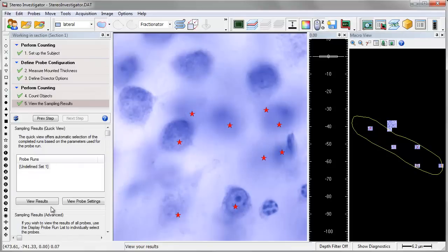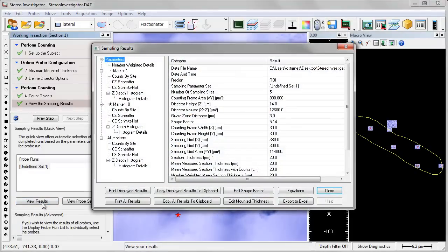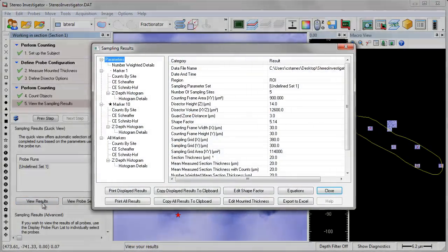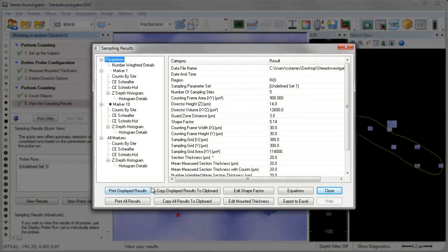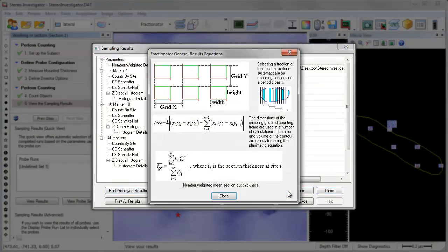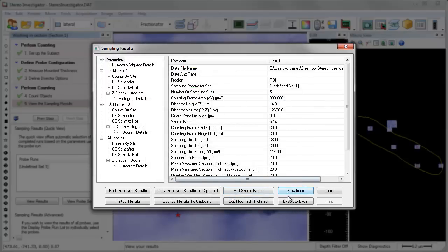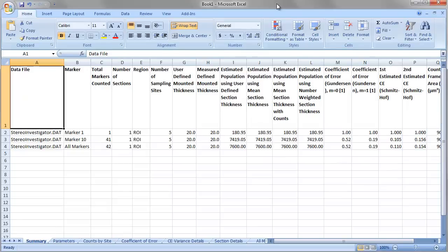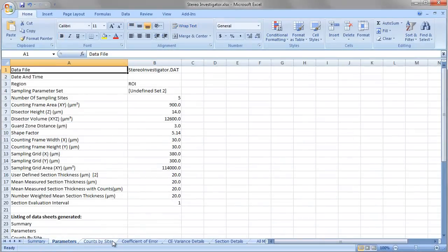After you have finished a probe run, you are able to view your results in StereoInvestigator. The results that you will be able to view will depend on each probe, but each time you view the sampling results, you will be able to see all of the equations that produced your estimate, the appropriate CEs, as well as export your results to Microsoft Excel with the click of a button.